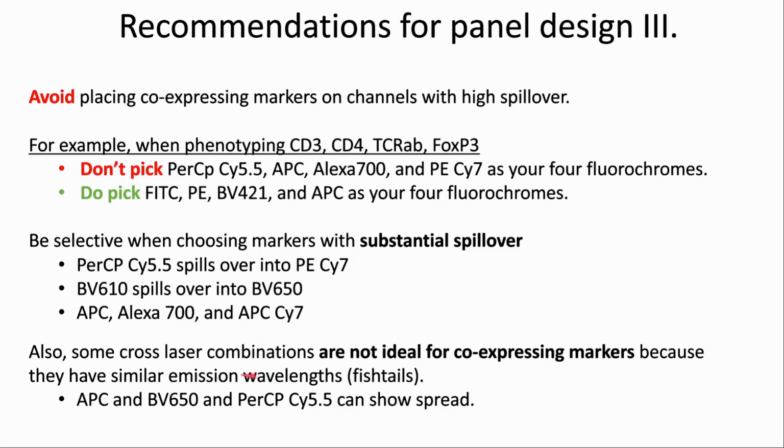Also, some cross-laser combinations are not ideal for co-expressing markers because they have similar emission wavelengths and may produce a fishtail or trumpet effect, which is a spread of the data when creating your final XY plot. APC, BV650, and PerCP Cy5.5 all have similar emission wavelengths and can show this fishtail effect.